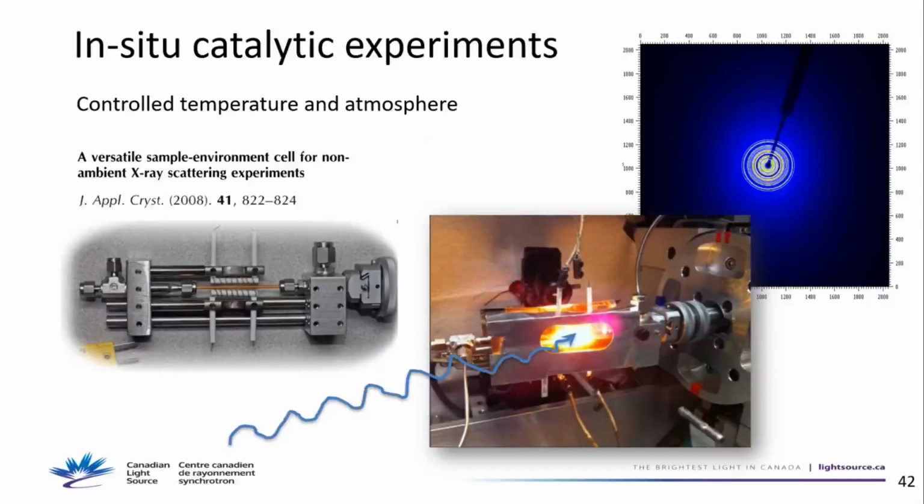The closest thing I've done in catalytic experiments is to come in with, let's say, CO, and I have a mass spectrometer on the output, and I can see what gases are on the output after the initial gas went through the catalyst material. I haven't done the other yet, but it's possible.